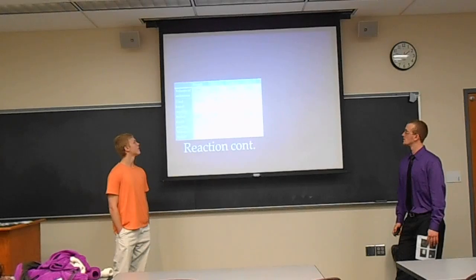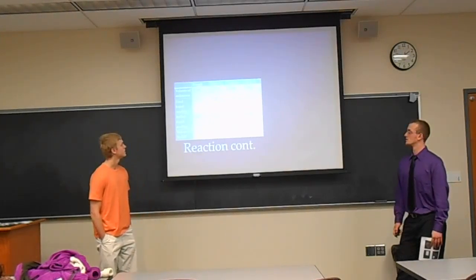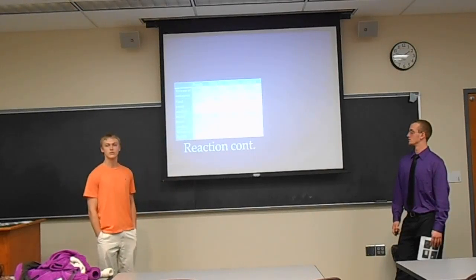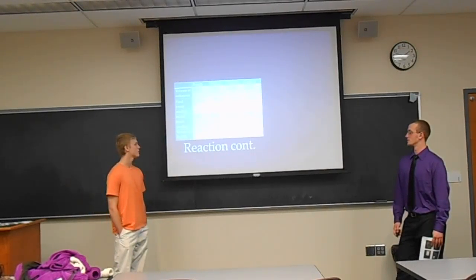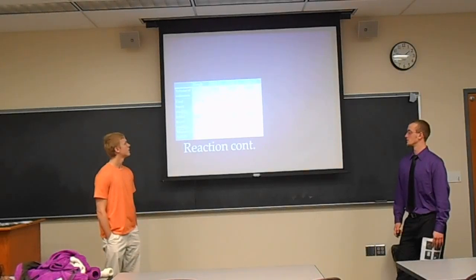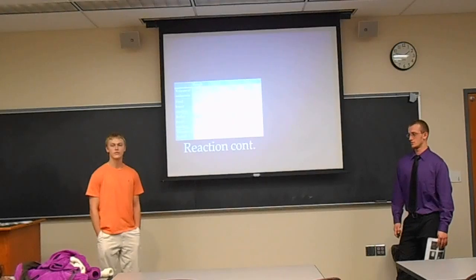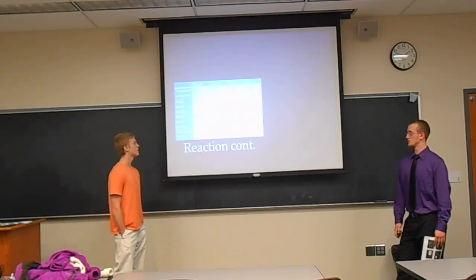Right. Our reaction continued, as you can see in our graphs. Each time we started at an initial burette reading of 0 milliliters, just to make it easy on ourselves. We're doing the calculations. Each time it ended up being a little bit different on the ending of the final burette reading, but it was pretty close, all the same.